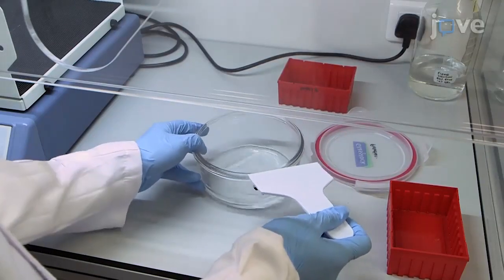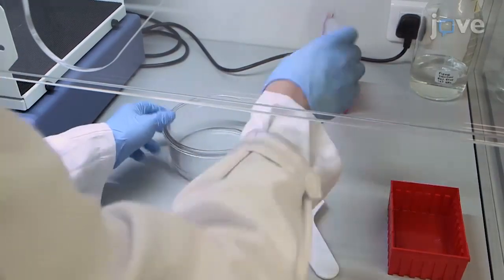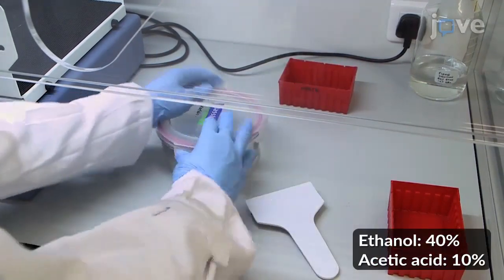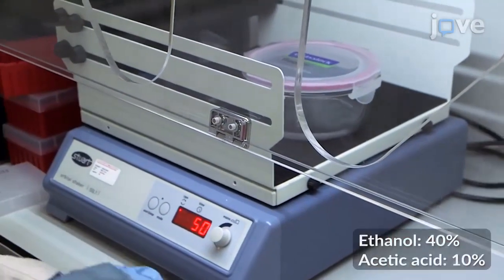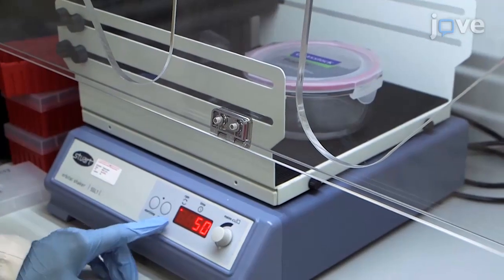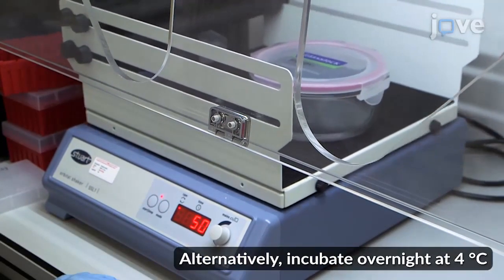After electrophoresis, submerge the gel in a 100 mL solution containing ethanol and acetic acid on an orbital shaker, and incubate twice for 30 minutes each at room temperature while shaking at 50 RPM.